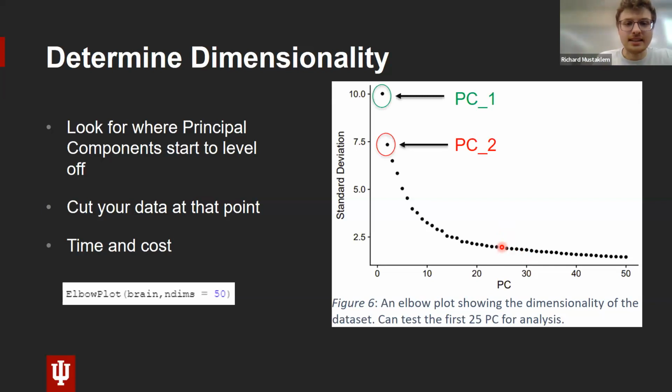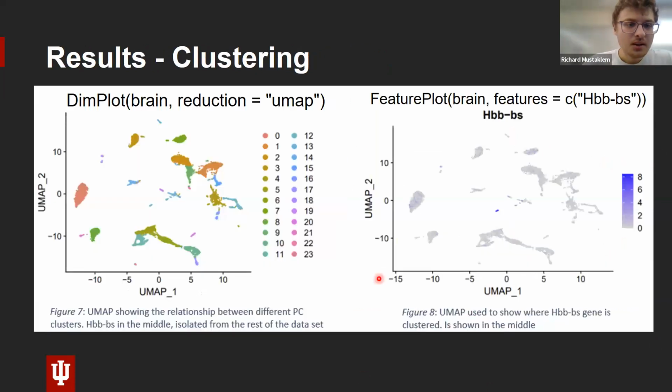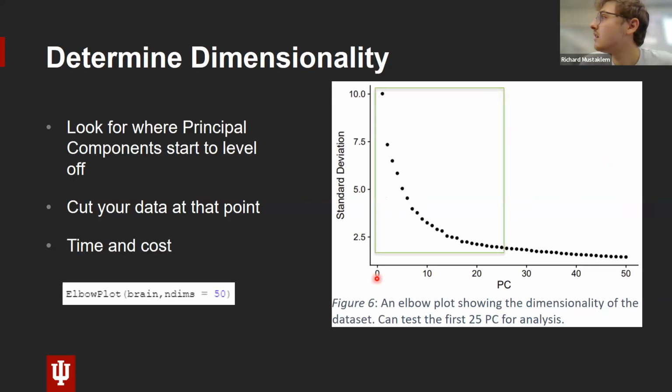And like I said, these are all individual principal components. So each one gets less and less meaningful because it's less variable. I'm just showing here that we're going to be cutting off at this point too. So, are there any questions so far?